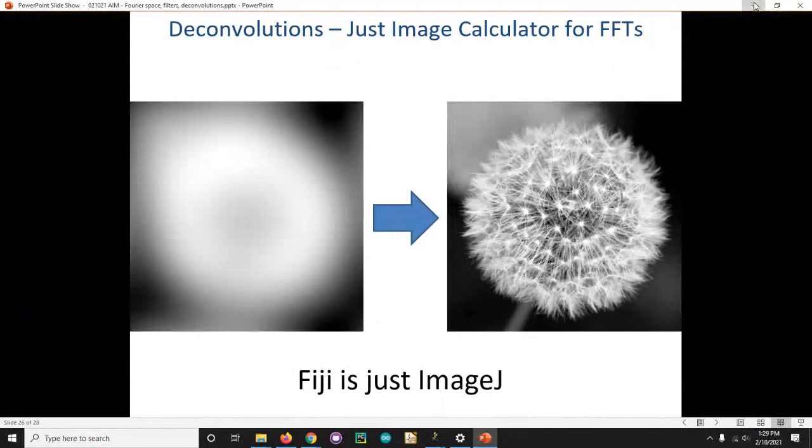You can do that even in ImageJ. So let's close this. Now we're going to grab our classic dandelion image again. Just to make sure, I'm going to do a little custom modification, like that trick where the magician signs the cards, so you make sure I'm not just reopening the same image. Now we have a custom image. And I'm going to grab my point spread function. Here's a terrible point spread function, a giant Gaussian. Our image is going to be super low resolution.